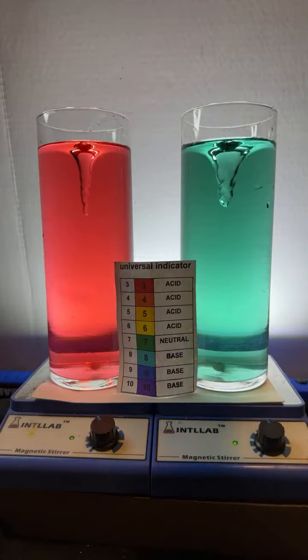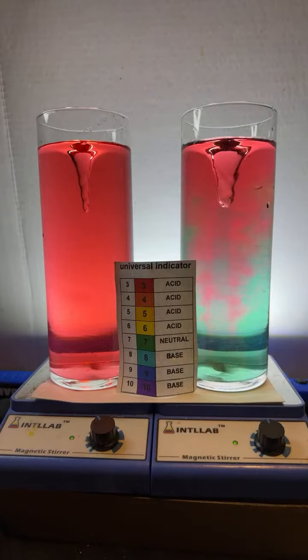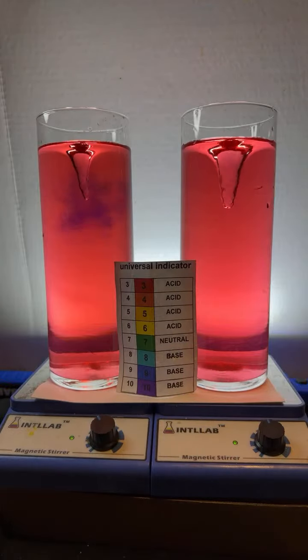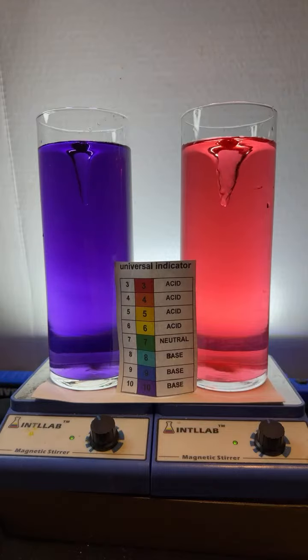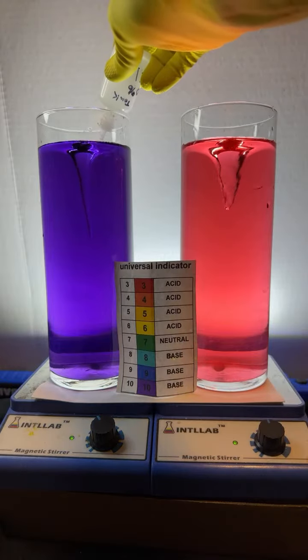All right, here we go. I'm going to add a drop of acid over here on the right. In goes the drop. And let's add some base over here on the left. In goes the drop. It's kind of like Northern Lights, chemical Northern Lights. The comments are coming through pretty quick here in the chat, so forgive me if I don't get to all of them. Here we go. Let's add a drop of hydrochloric acid over here on the left.